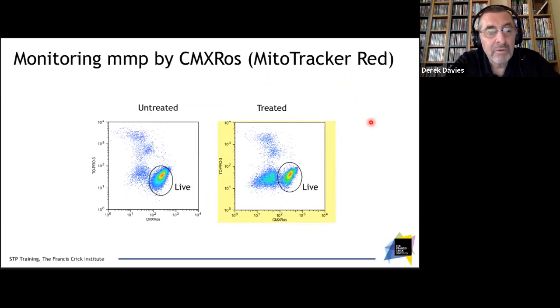And remember, what we're looking for here is a reduction in fluorescence as cells enter apoptosis. So what that means is when we come to our flow cytometer, we need to make sure we set our voltages sufficiently so our live cells are pushed a little bit more to the right than we might normally put them, because we're going to be looking for a reduction in fluorescence. So normally, again, with phenotyping, I expect things to go that way. They're going to be positive. Here, I'm expecting my apoptotic cells to be negative.